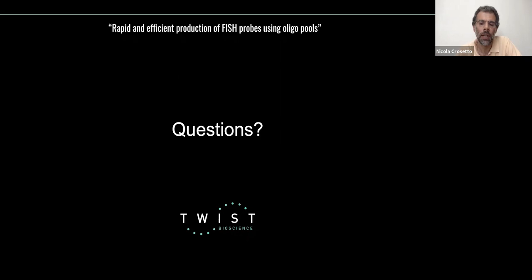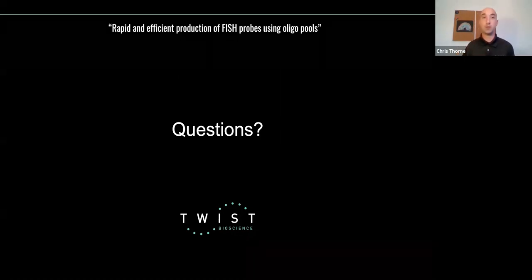I would also like to add that we are also targeting the transcriptome, starting again with human and mouse transcriptomes. So hopefully we'll be able to enrich the tools for the community pretty soon. Fantastic. Just for your information, Nicola, someone here is working on integrated viral genomes as well, so interested in using it potentially on viral genomes too.